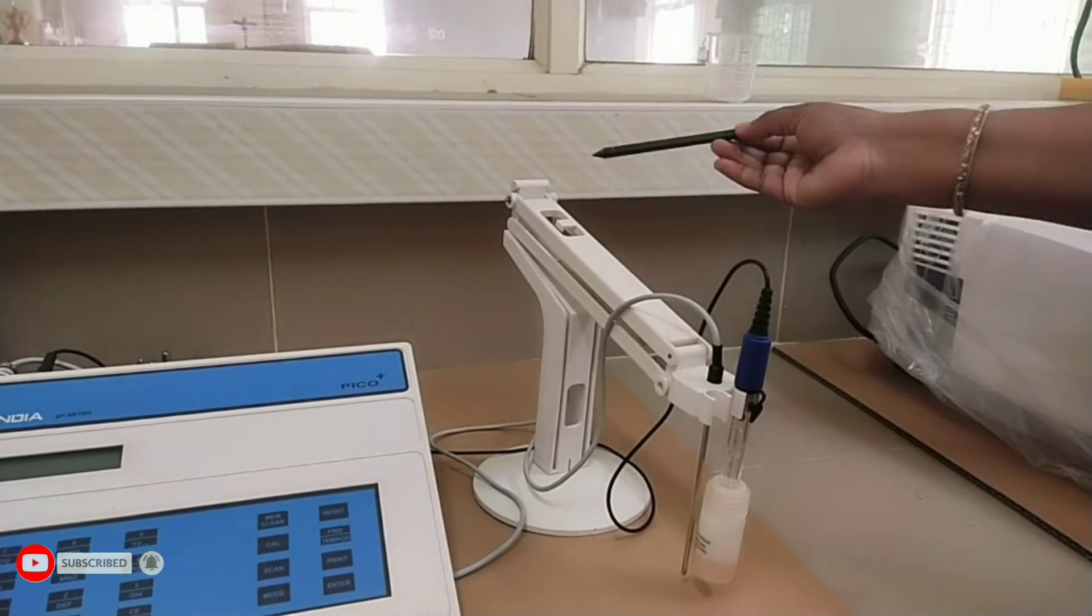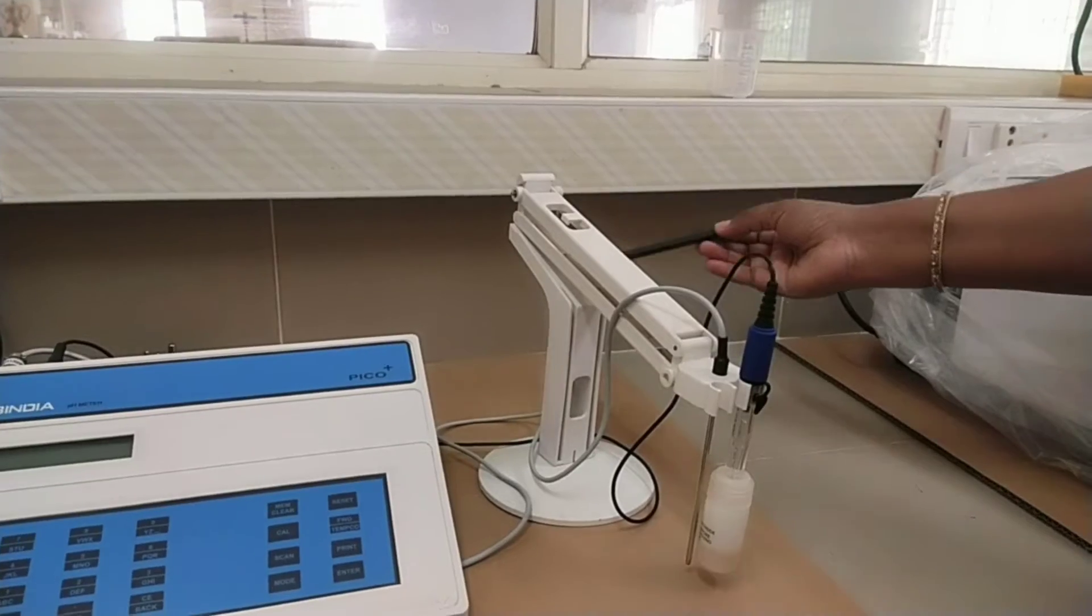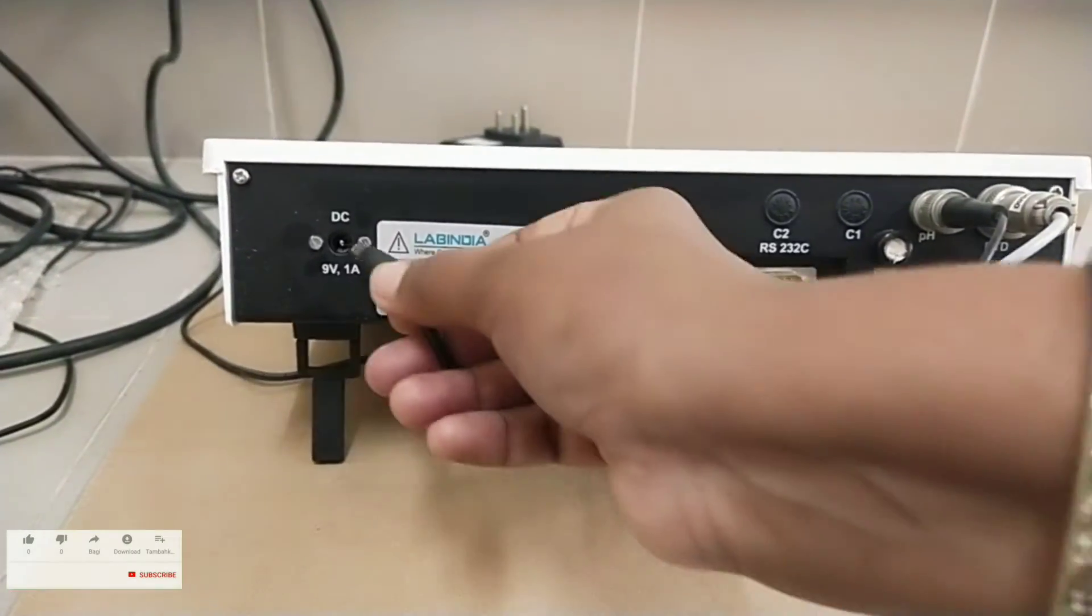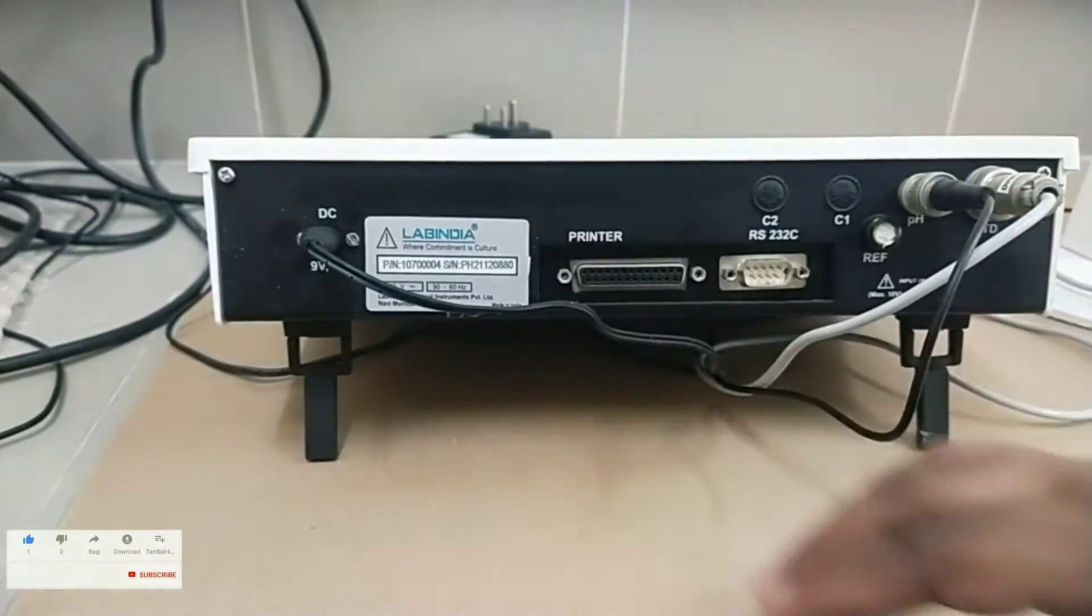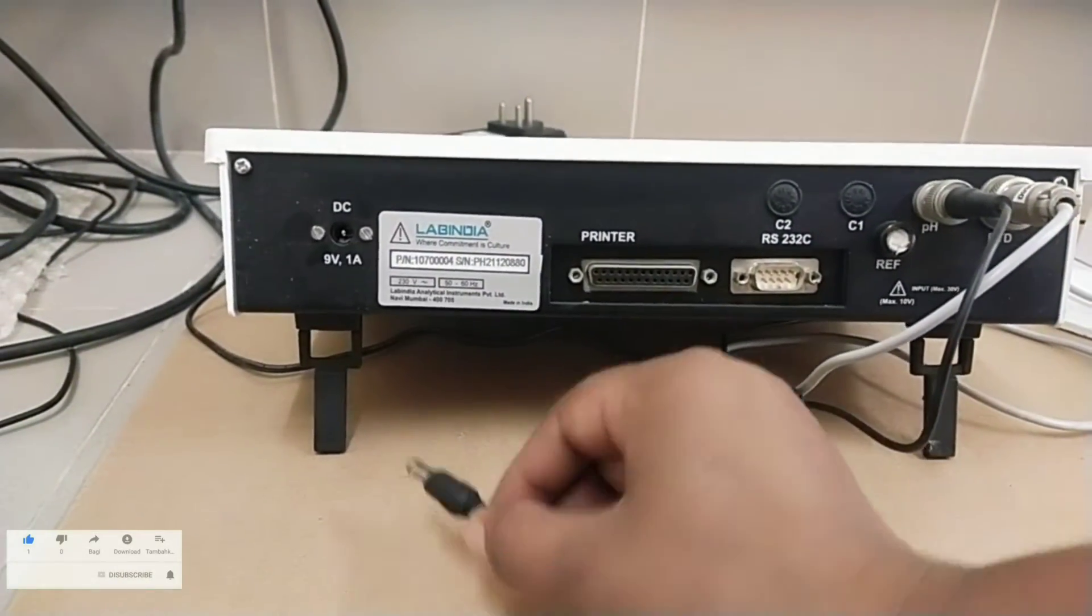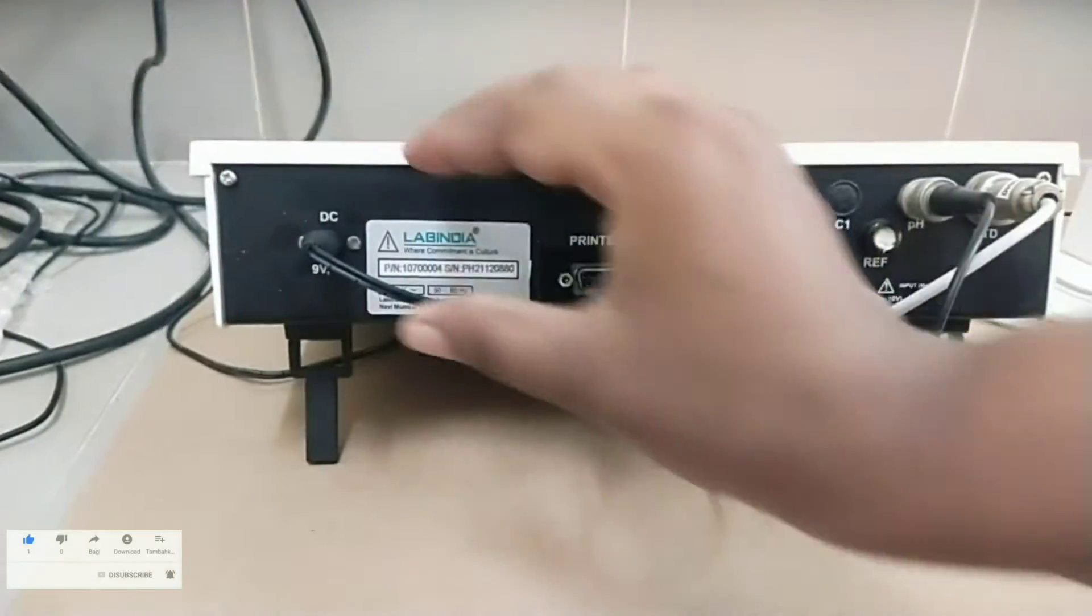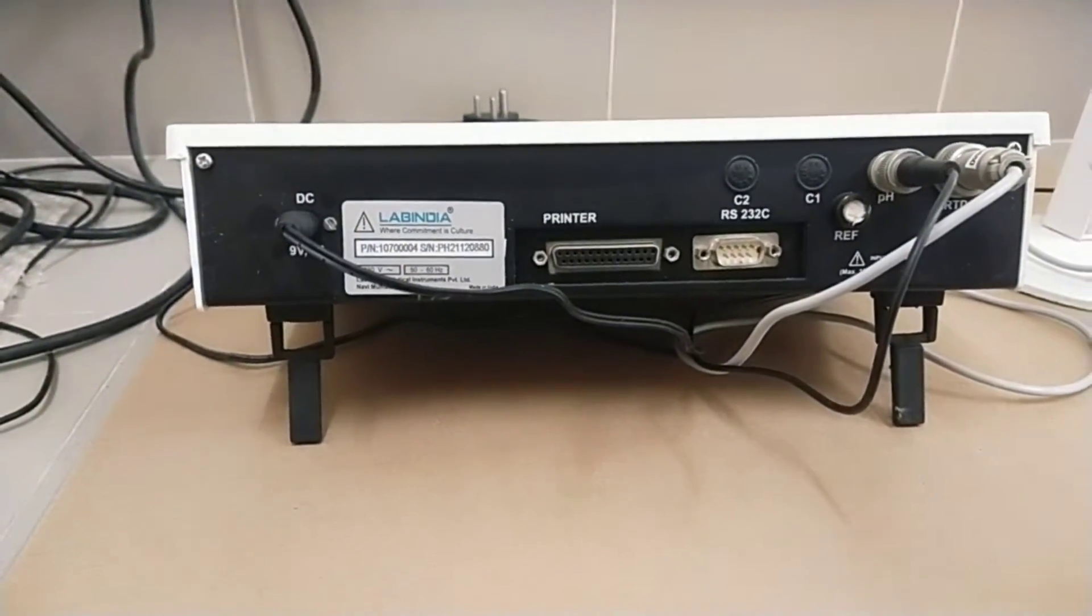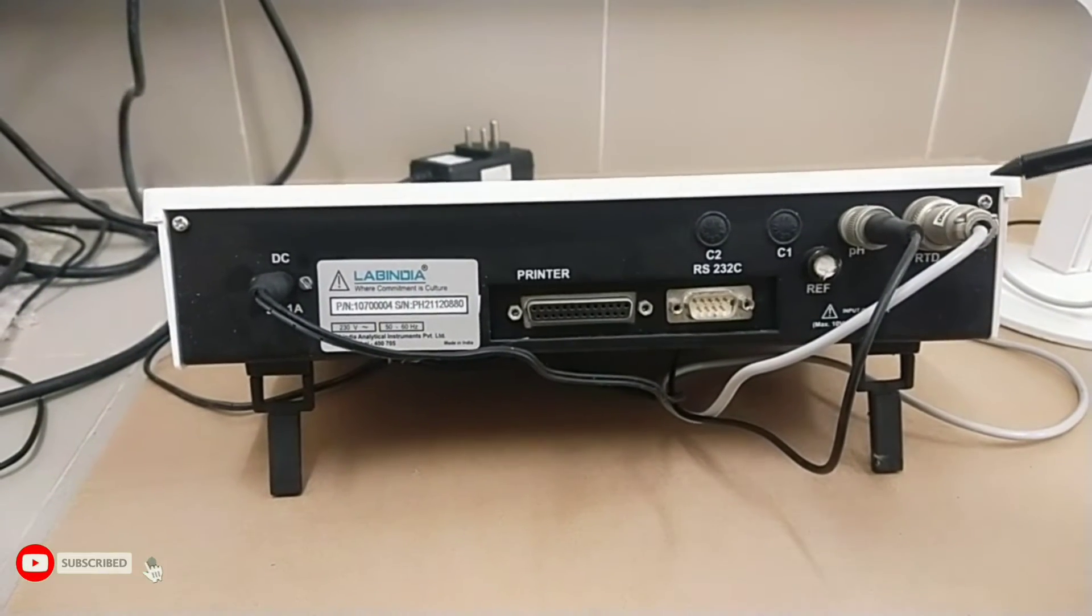Stand arm. Wing nut for locking arm. Base plate. PICO pH meter has two functional panels: front panel and back panel. Let us have a look on back panel. Back panel consists of DC power adapter input, connector for pH electrode, connector for temperature probe.